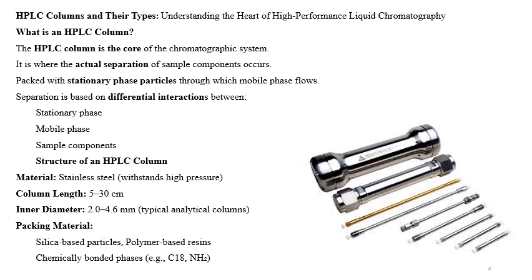As it is a chromatographic technique, the separation happens based on the different affinity of the compound or analyte with the stationary phase and the mobile phase.